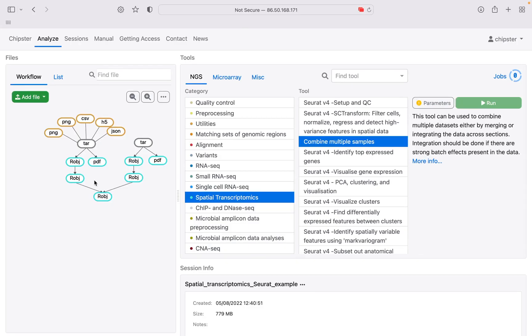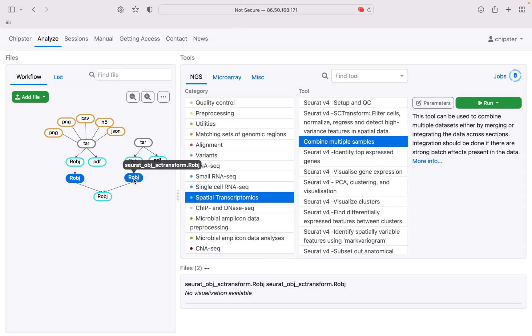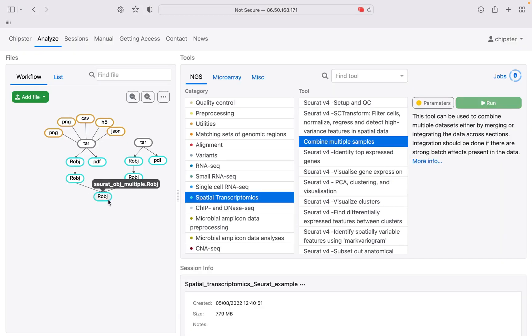The combining tool can be run by giving the normalized R-objects to the tool and choosing the combining method. As output, you get a combined R-object, which you can give to the next tools.